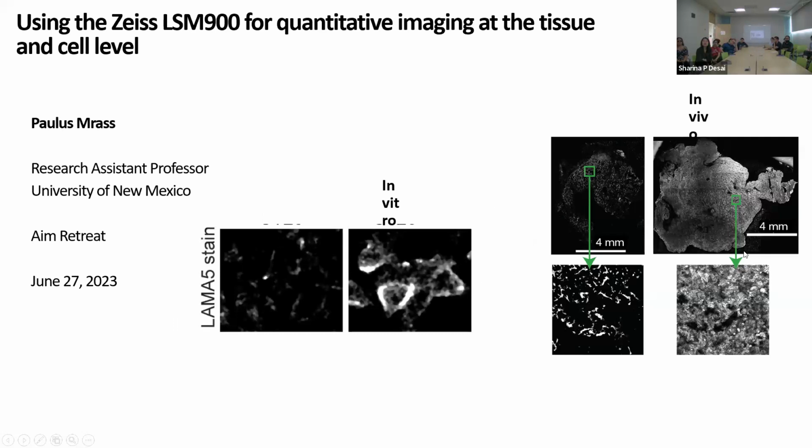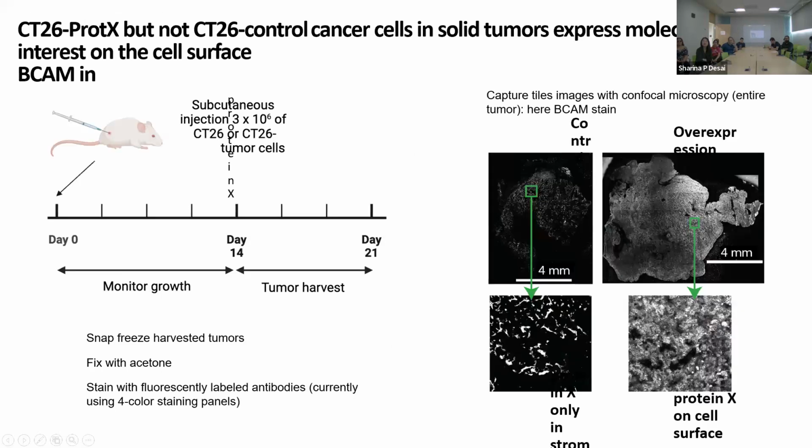And the other thing I'm using it for is staining and visualizing tissues, in this case, tumor tissues. And I mean, after hearing what Sharina said, maybe the Salomix could actually be a really good option for that. But for getting the data, it works really well. So these are the two things I'm doing, and I just have 5 slides or so where I'll explain a little bit more of what I'm doing.